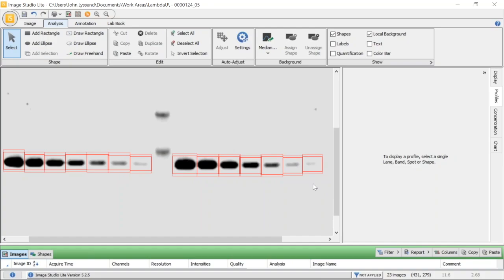Great. Now we've gone through to find our regions of interest for each band we want to quantify. We then defined our background method to accurately subtract unwanted background signals, and went through the profile tool and confirmed accurate shape size around each band.